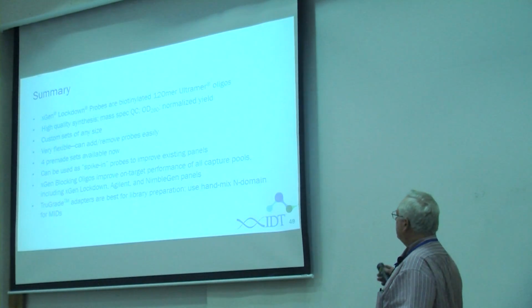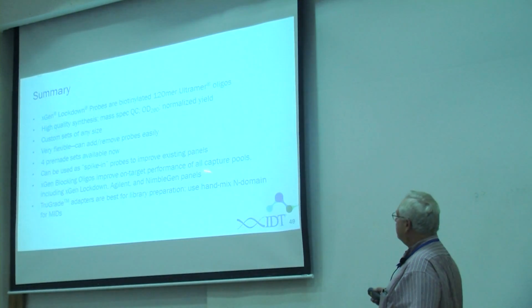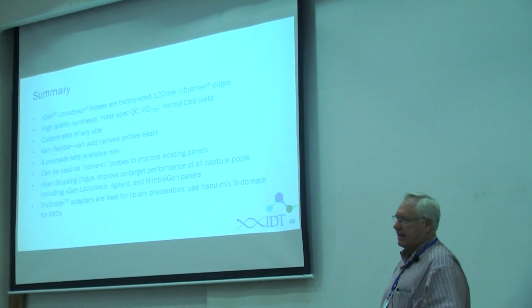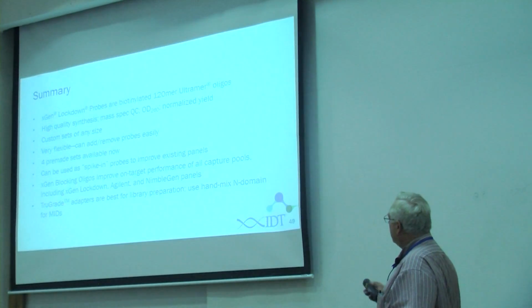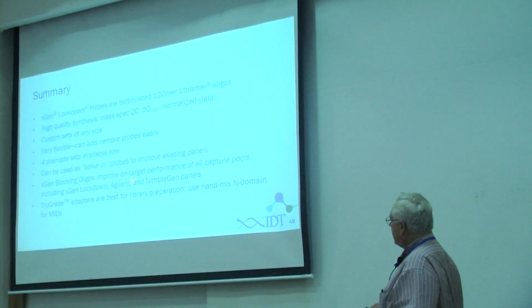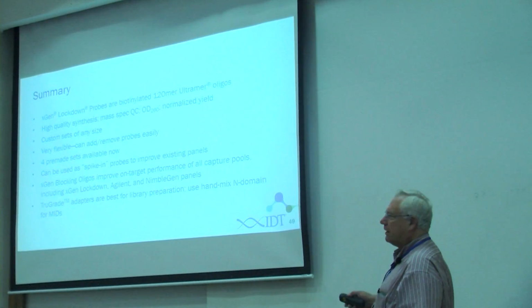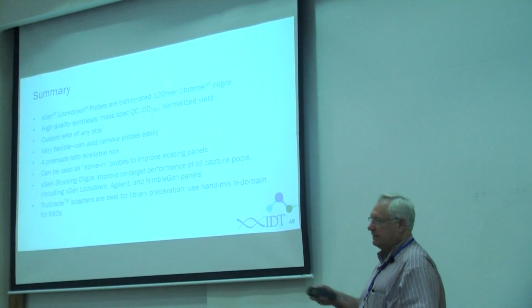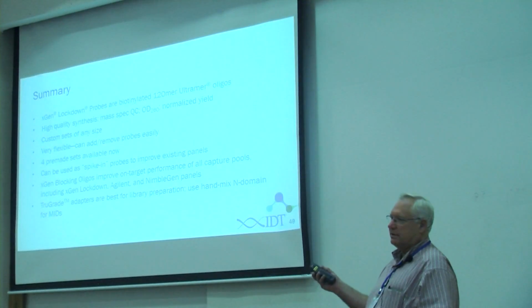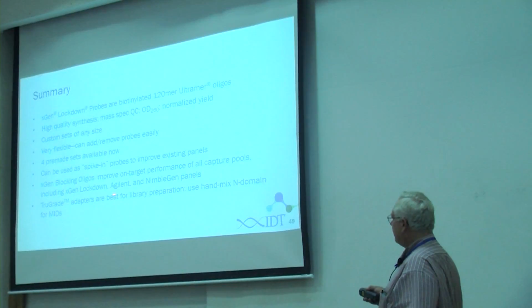It's going to be a lot more cost effective. If you're going to do a fair number of capture events, then really consider the lockdown approach, because after you start doing enough samples, they actually become cheaper, and the quality of capture is far superior. And regardless of what system you use, look at these chemically modified blocking oligos. They improve every method of capture, whether it be Agilent, Nimblegen, IDT, whoever, because everybody's got adapters, and these things work better.